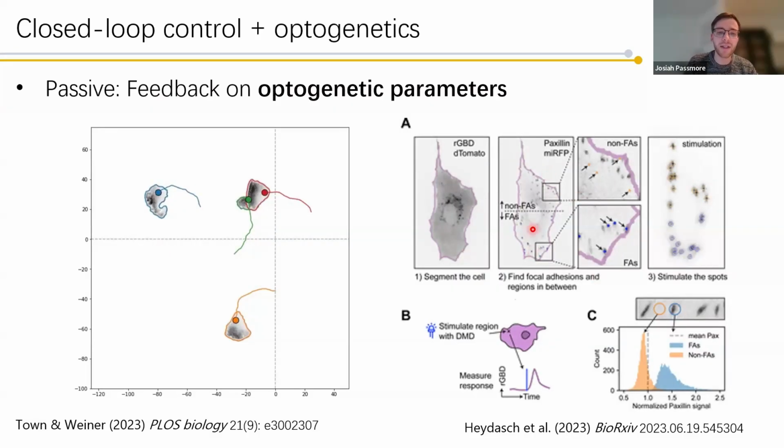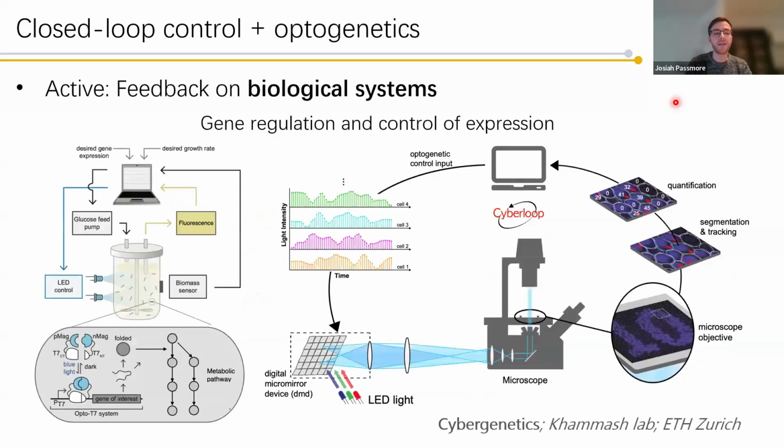Another example is where they're looking at focal adhesions. You segment the cell, detect focal adhesions, and selectively stimulate specific focal adhesions.